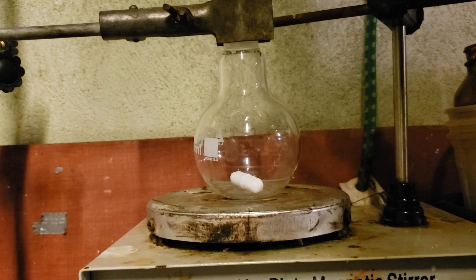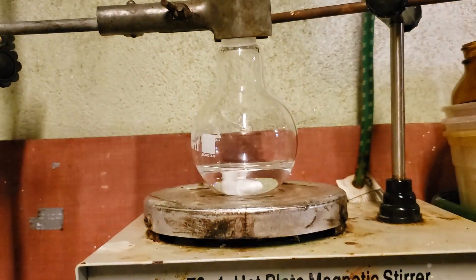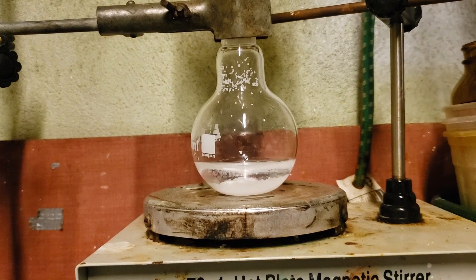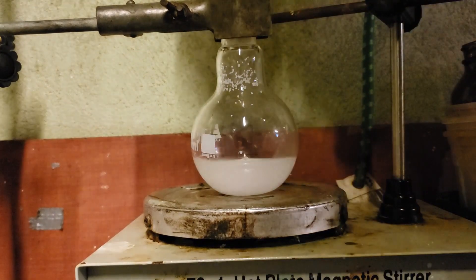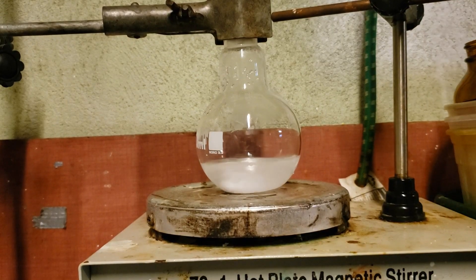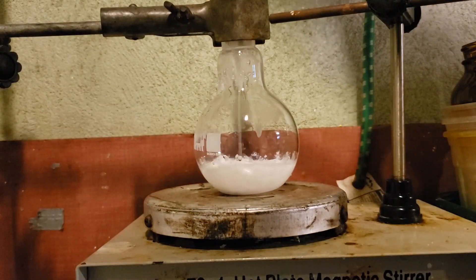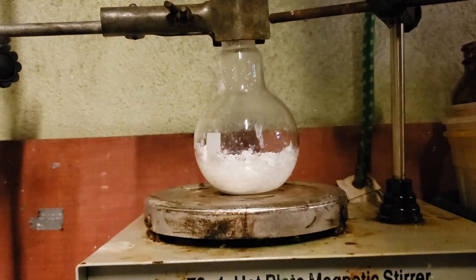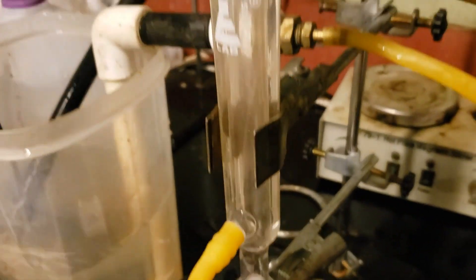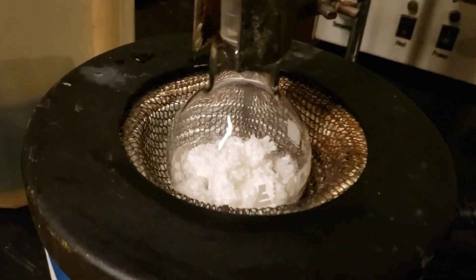6.25 grams of sodium hydroxide is dissolved in 20 milliliters of distilled water with stirring. Next, 10 milliliters of wintergreen oil is added in. A white curdy precipitate immediately forms. The flask is then transferred to the heating mantle and refluxed for 30 minutes, over the course of which the precipitate dissolves, forming a slightly yellow solution.